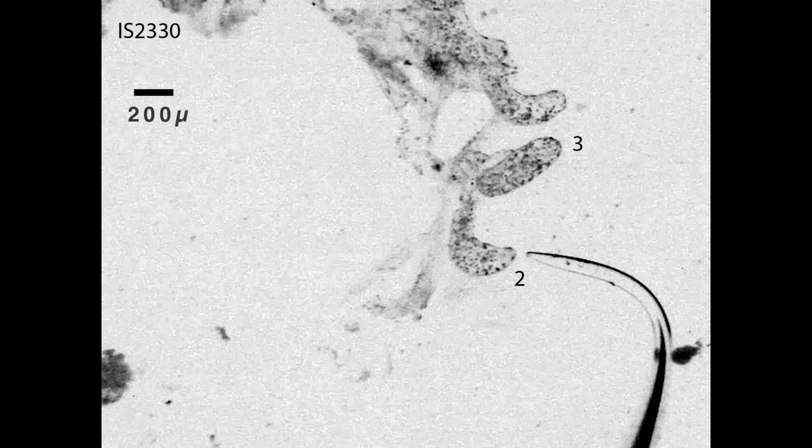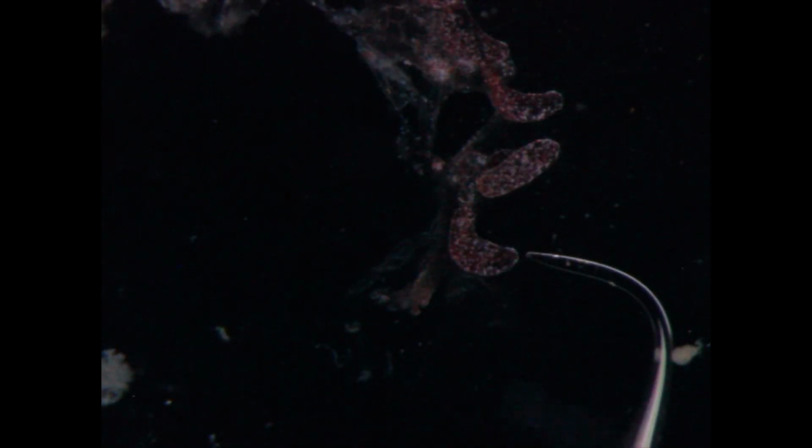Ampulla 2, a pair with 3, will be compressed for 20 seconds by the slender curved glass probe tip, which was pulled from the glass tube held by the pusher. The tip will be moved over the ampulla just before the push. The results will convince you that compression can alter the pattern of contractions, but will also raise many questions. There were 2 pushes in the 20 minutes of the full experiment. Here we see 5 minutes that brackets the first push, but it's speeded up 8x.